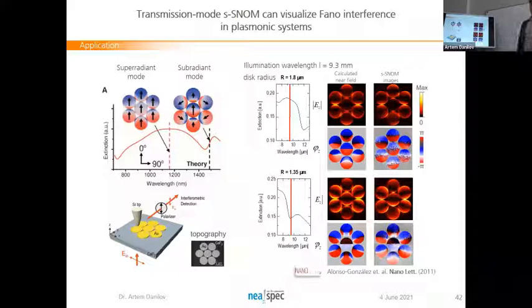But the lecture showed that you detect in depolarized light. Sorry? In the lower left corner, you show that the detected signal is vertically polarized. Yeah, that's fine. Yes, it's not a polarizer, it's an analyzer, I guess. Yeah, it's an analyzer. So in this case, you just detect the normal. You excite from here, the incoming excitation, and then you detect from a tip, and this signal is collected on the top with a parabolic mirror, and then you insert some analyzers, whereby you can control the polarization which you want to investigate on the surface.